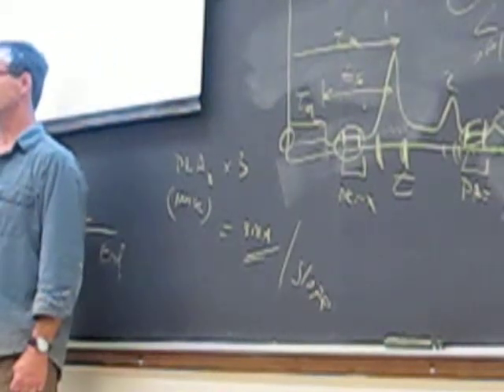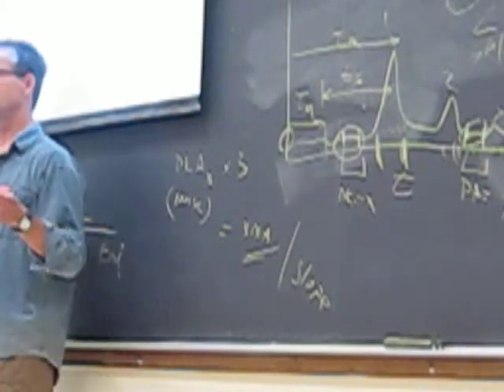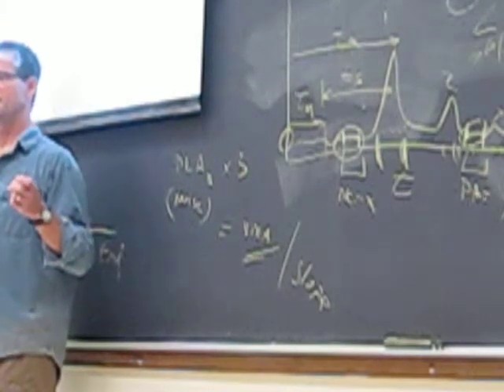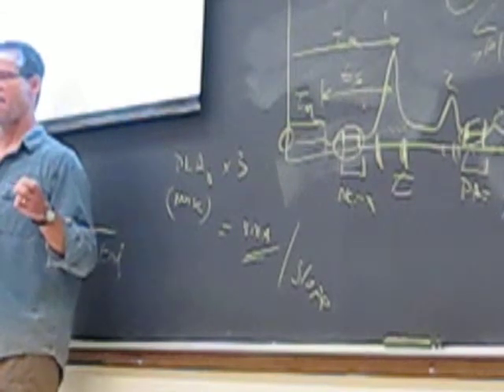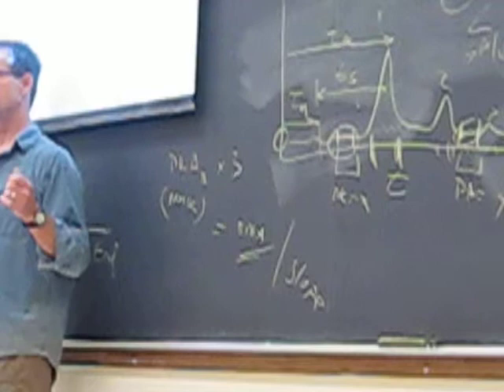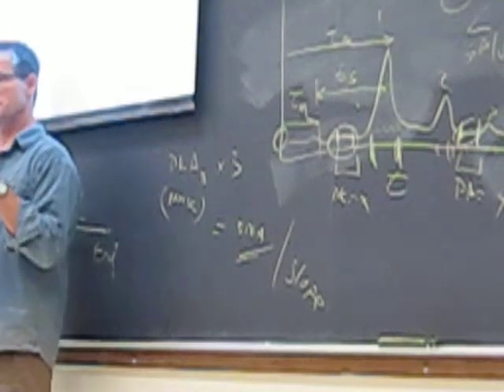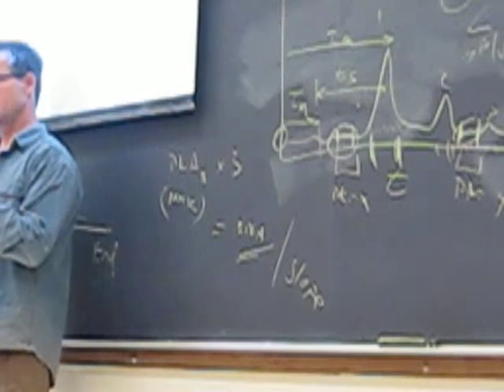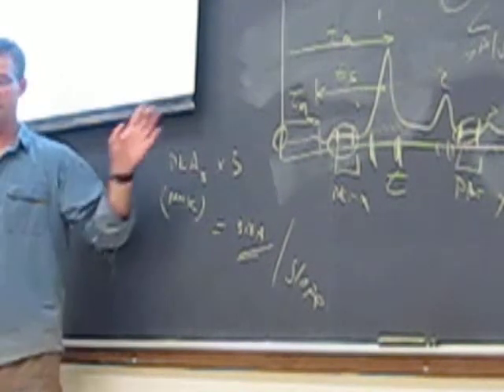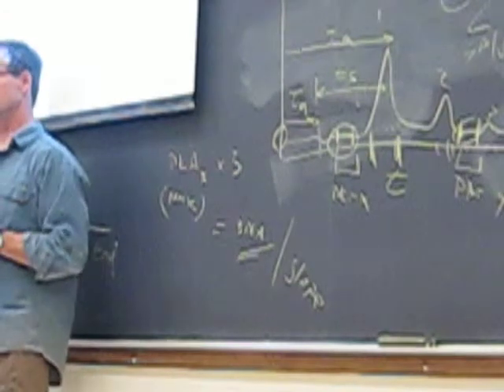Okay. And the slope has the units of what? Microsiemen per ppm, or microsiemen per concentration. Right. In your case, it's going to be microsiemen minutes per concentration, right? Because you're doing area per concentration, per milligrams per liter, or whatever.